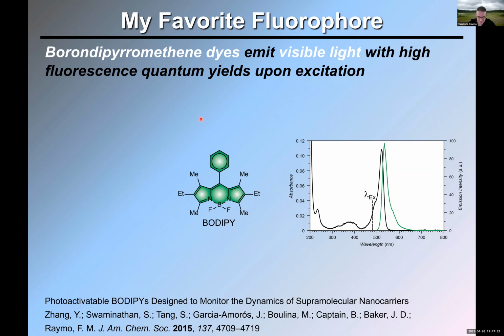And, yeah, so I guess thanks Murthy for the introduction and for the opportunity to lecture within your class. So what I'll try to do today is to give you a general overview of fluorescence imaging. I take for granted that you all know what fluorescence is and how it works. And I will just try to show you how fluorescence can be used to acquire images using microscopes and how those images can be used to study biological samples. Okay. And I will be happy to give you copies of the slides later if you want. And of course, if you have questions, just stop me and ask.